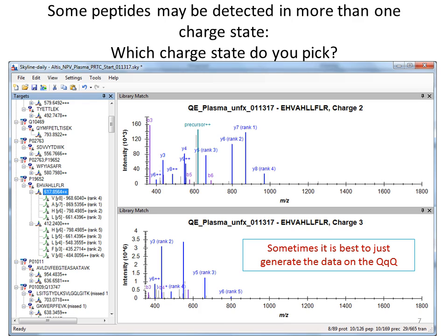Those are ions you wouldn't normally see unless you're doing electron capture dissociation or electron transfer dissociation. And A and X ions are not normally observed, but you can label them if they're in there. And then the precursor is green because that is what they call unreacted precursor, which means you didn't fully fragment it, so you could generate more intense ions if you adjusted the collision energy. And so seeing it labeled there is helpful because you're like, oh, I can optimize that.